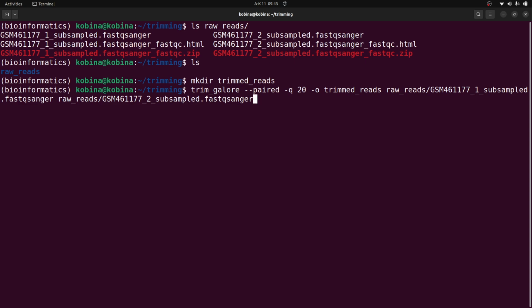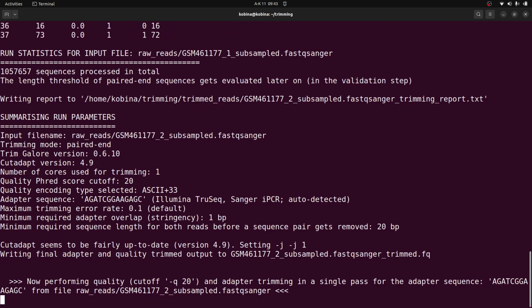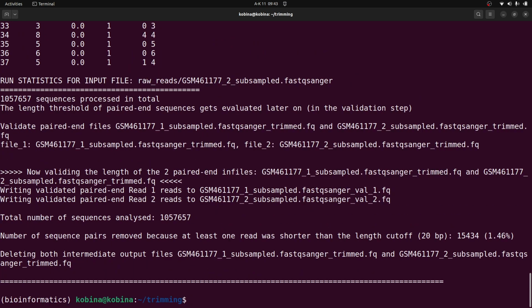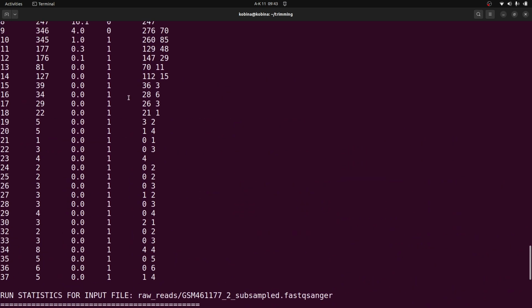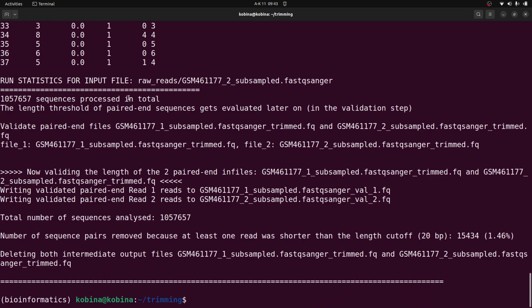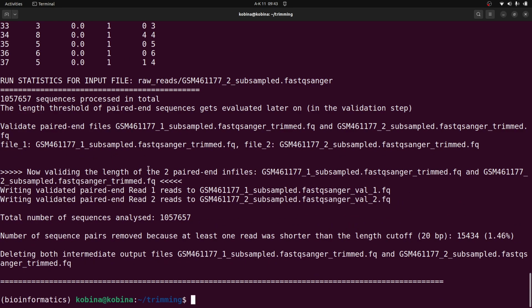So once we do this, we can execute, and when we execute, trim-galore will start doing its work. So this is what we are going to see. And of course, once it's doing its work, it also indicates reports. So it tells you what has been done. So we have the report indicated here. Okay, so you can save this to an output file, all right?